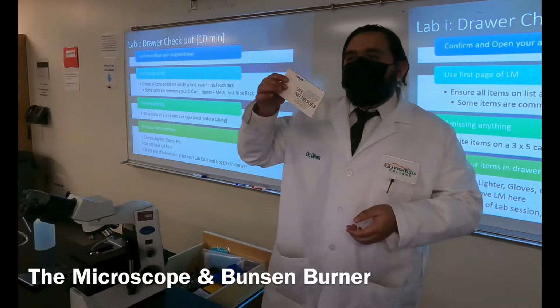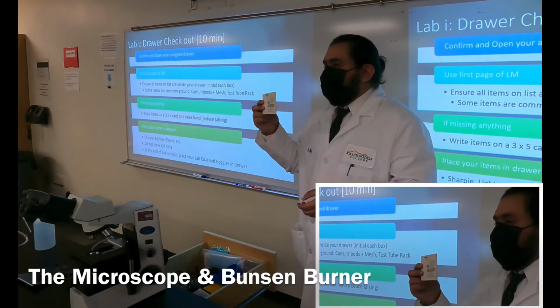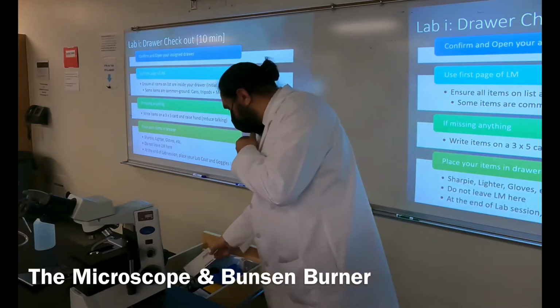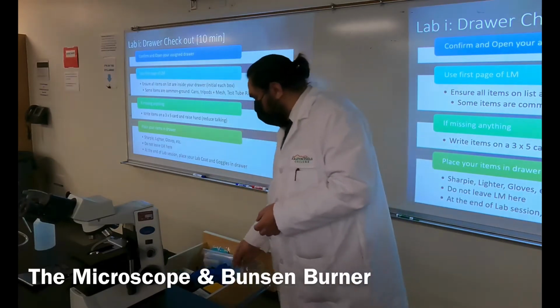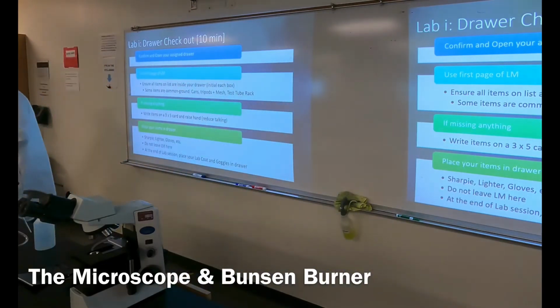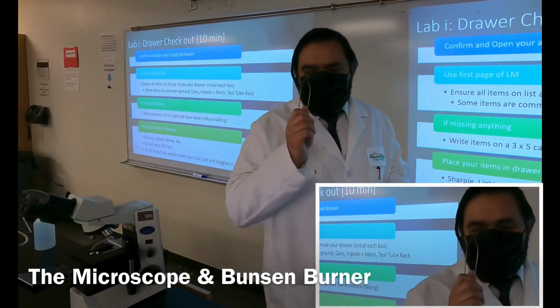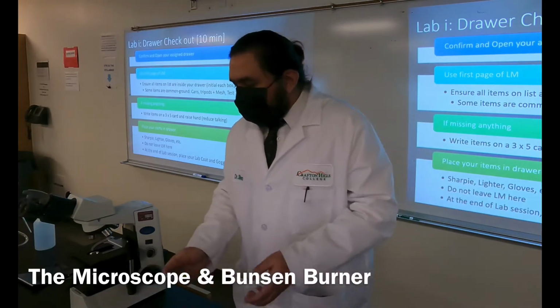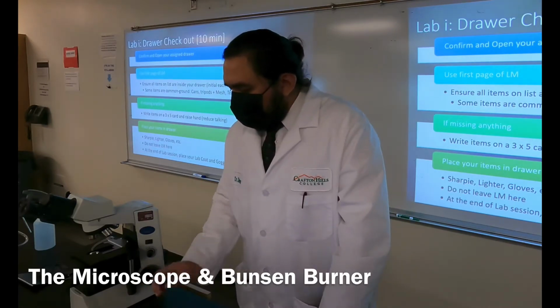The other item you're going to look for is something that looks like a little strip of paper, a little box of paper, which is your lens cleaner, right? So that one, make sure that you only handle it with gloves because the oil on your fingers will contaminate it, right? You should have your little test tube brush, for example. And probably one of the more important ones of today, which I have hanging out over here, is going to be a wire test tube holder. So we're going to train you how to use these guys expertly a little bit later. So you need to make sure you have that guy hanging in there, right? So you should have 2 inoculating loops and needles in there, 1 of each. And then everything else should be set to go.